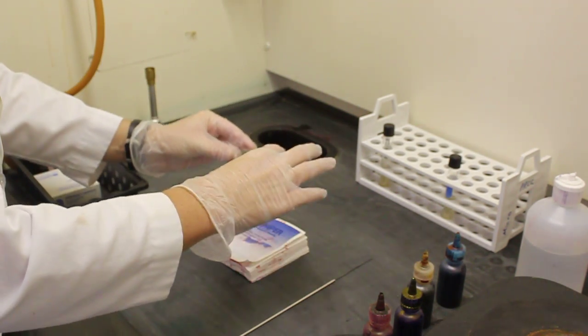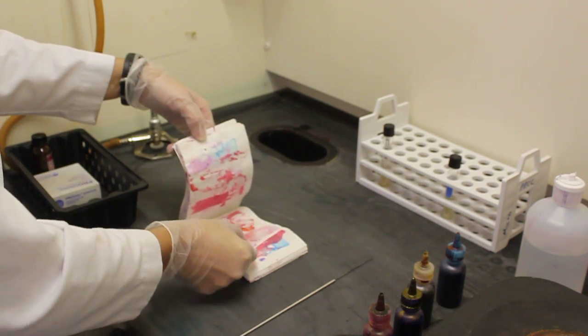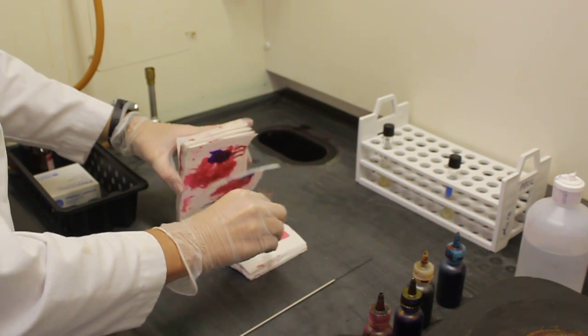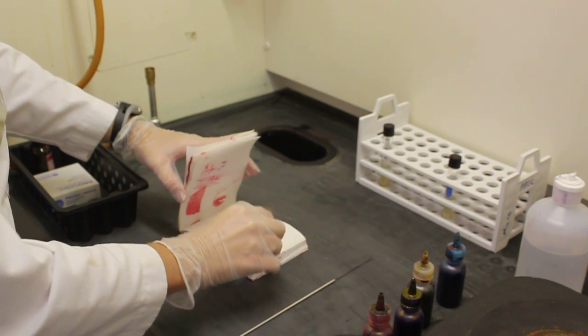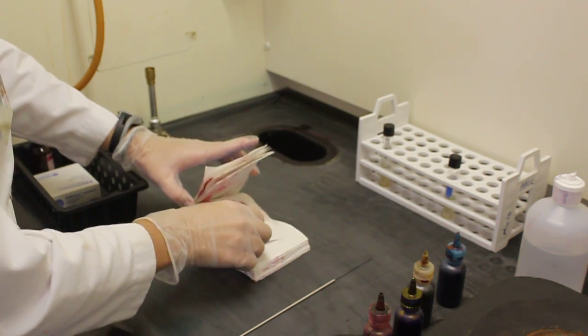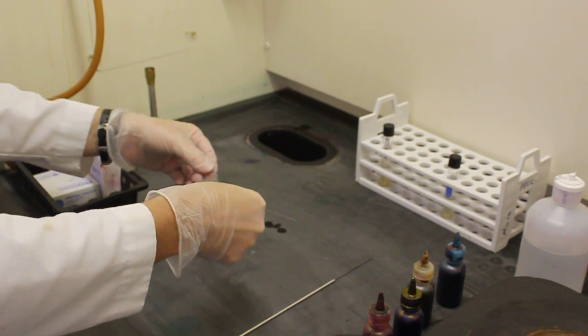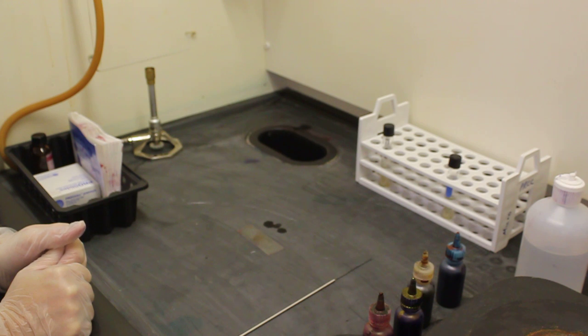Grab my bibulous paper making sure to keep it upright. Place the slide in the bibulous paper and pat it dry, changing the pages and repeating the procedure until the slide is completely dry. This slide is now ready to be placed into a microscope to be focused.